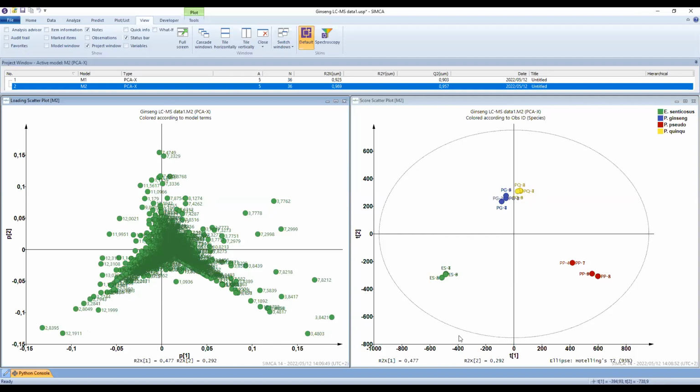You can confirm this by selecting a few samples from one cluster, going on to the chromatograms, and then you see if the signals that are at these retention times are markers or are occurring in high amounts. And then you can do the same here, and then you can do the same there, just so that you get an overview of your results.